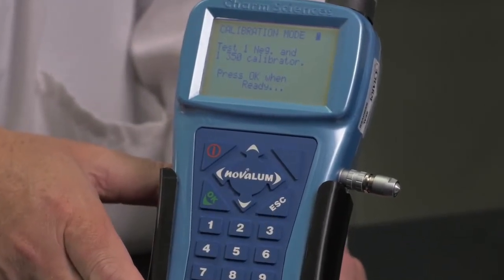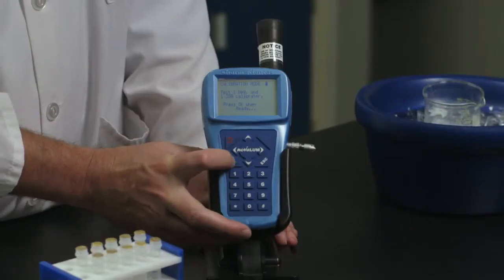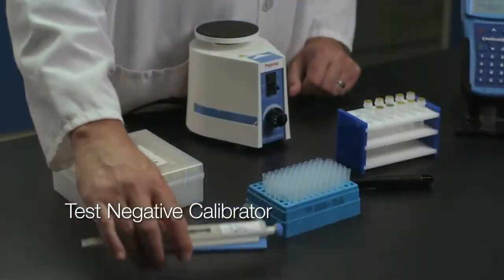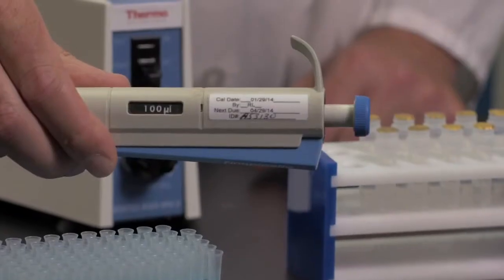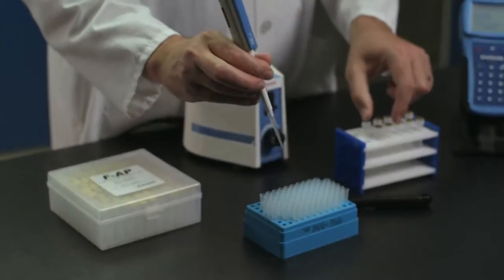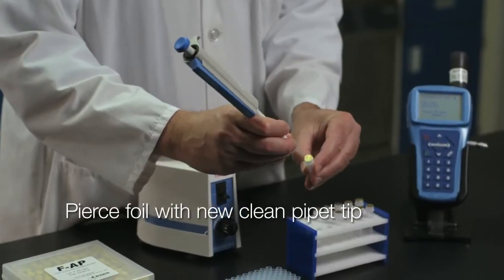This screen prompt will appear. Test one negative and one 350 calibrator. Press OK when ready. You will test the negative calibrator first. Push the appropriate 100 microliter pipette tip onto your pipette. Pierce the foil with a new clean pipette tip.